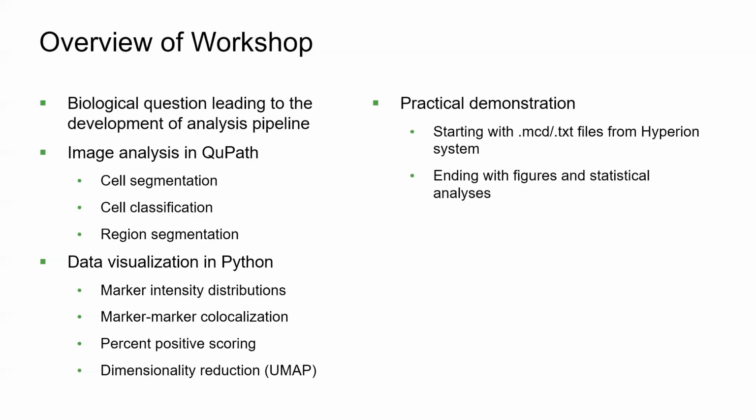The second part of the workshop, essentially at the end of this presentation, will be a practical demonstration. As the title suggests, this is meant to be an end-to-end workflow. So I'm going to start off with the typical MCD or text files that are available from the Hyperion system, and ending with statistics and figures that one could potentially use in a publication.